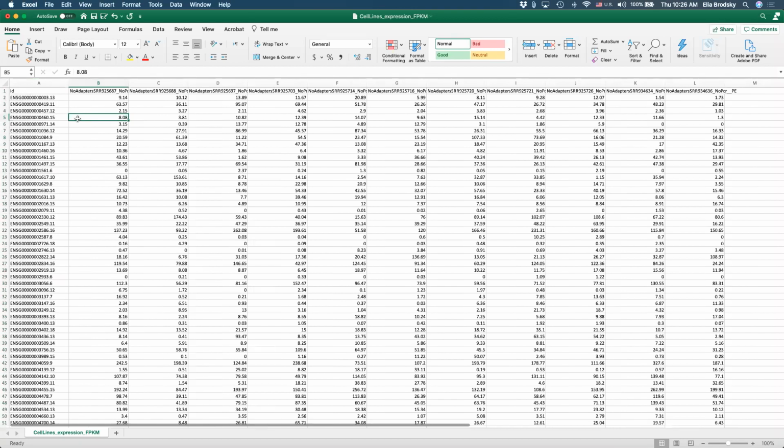All right, great. So again, it doesn't matter where you open this. You can open it in Google Docs, in R, in Python, whatever you like to work with. The point is we want to take a look at what is inside. Here we have gene IDs, and here we have the name of our sample. The actual name of the sample is this right here. This is the Sequence Read Archive ID. And this was added by the pipeline because adapters were removed and PCR cleaning was done. And this was a paired-end file, right? So all of your information is stored right here.